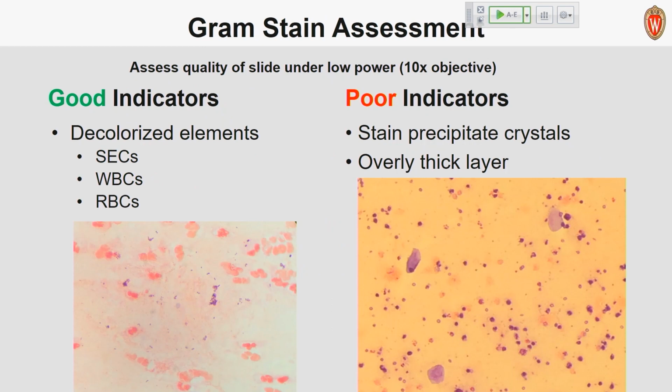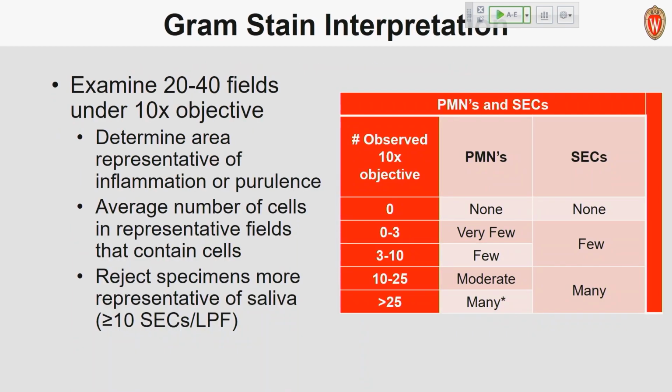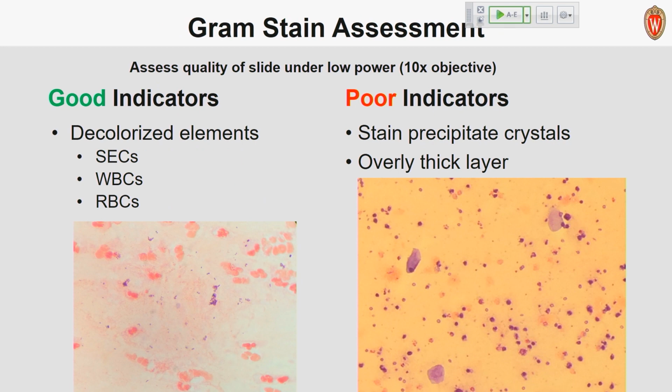Yeah, looking at a gram stain assessment. Whether you're doing an automated stain or a manual stain, you're going to still perform this gram stain assessment in the same manner. But you would definitely see more variation in automated stain because of how you're potentially utilizing it. You might be putting everything in together: wounds, abscesses, sputums, urines.